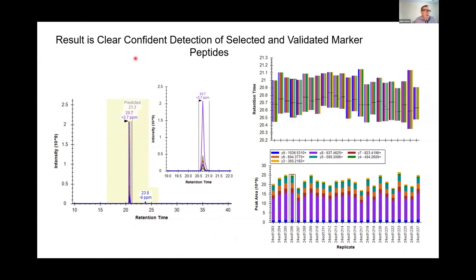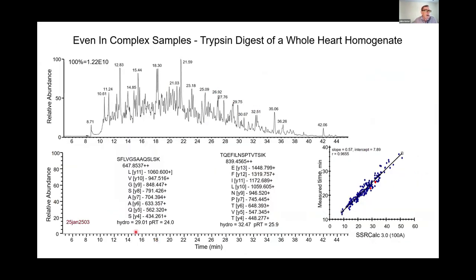But generating this chromatogram is the goal of the development process. And all of this works even in very complex samples. Dennis showed this total ion current chromatogram. These kind of look like chromatographic peaks, and this is actually smoothed to make it look prettier. But it's just a lot of data.